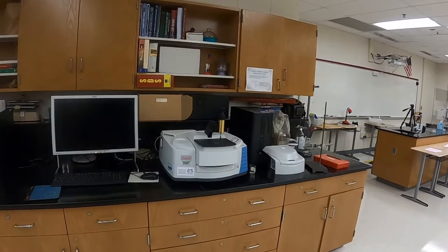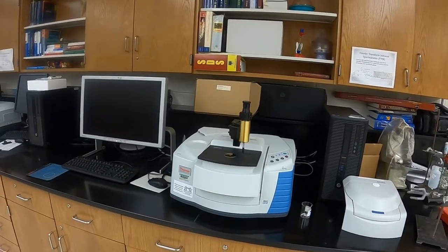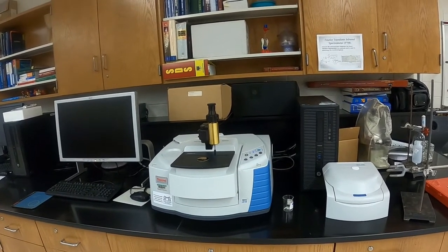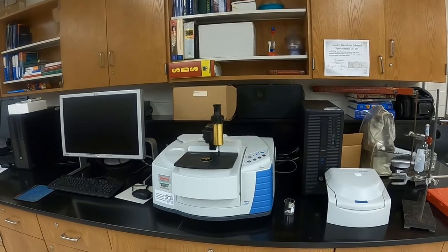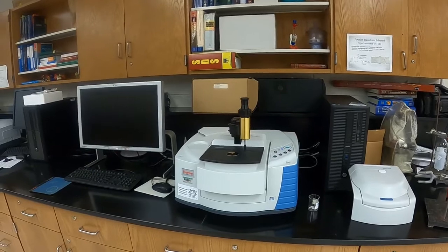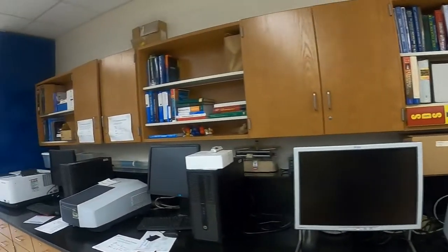Among the many types of equipment we have in the lab, one of which is called a Fourier transform infrared spectrometer, or FTIR for short. In this instrument, you can essentially make or create a bond energy map of the bonds within a molecule, and from that, determine functional groups and begin to determine molecular structure.